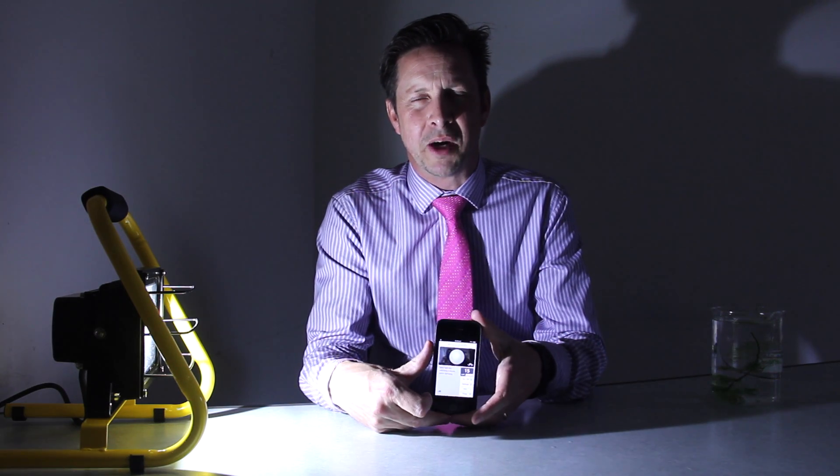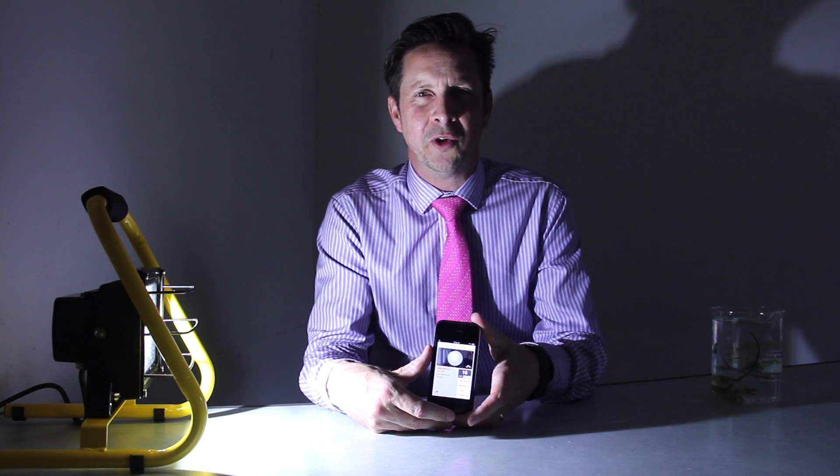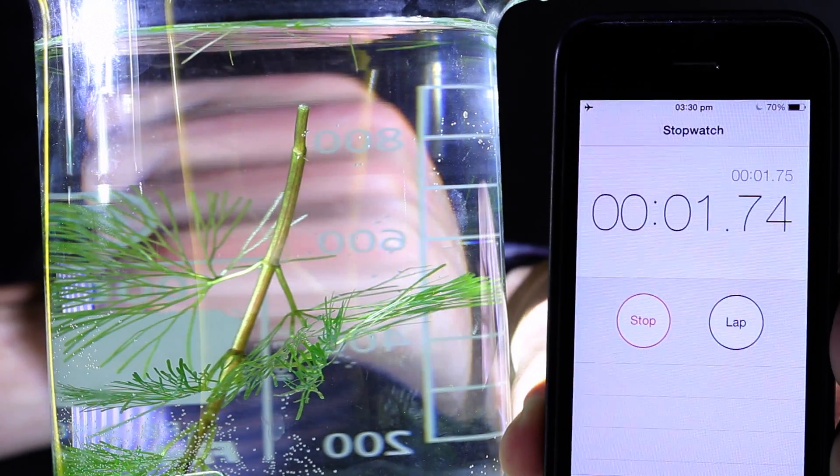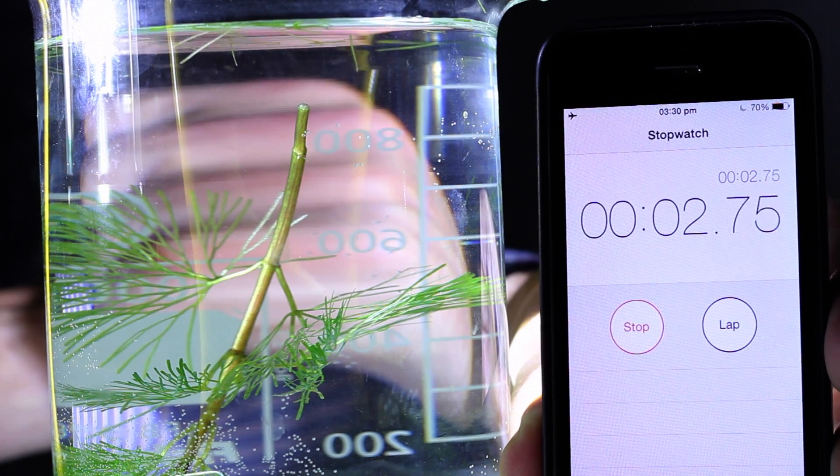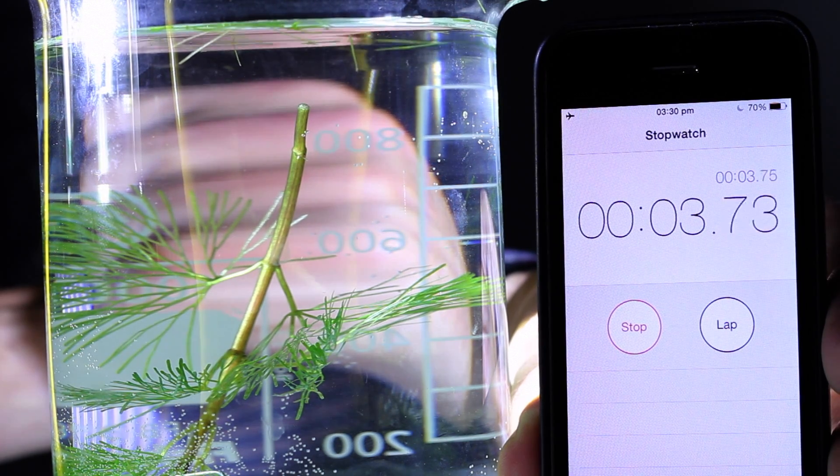Now traditionally, with light meters being perhaps expensive and difficult to get hold of, we've maybe used a meter ruler or a tape measure to illustrate how, with increasing distance, the rate of photosynthesis changes.